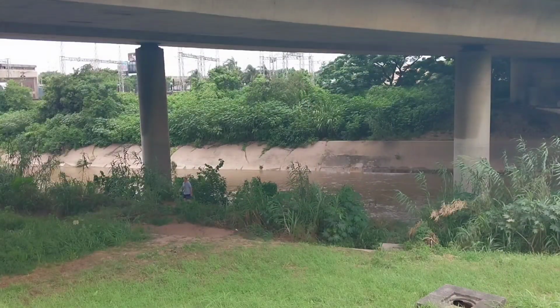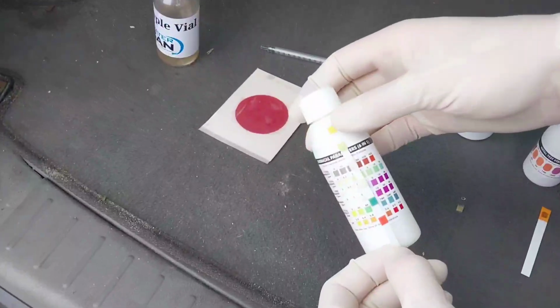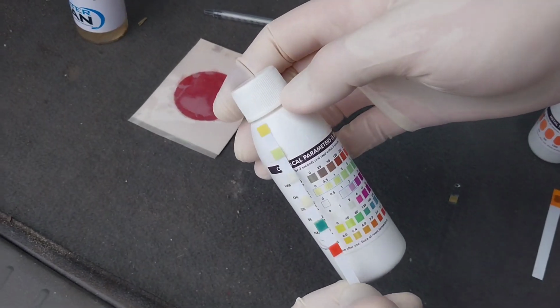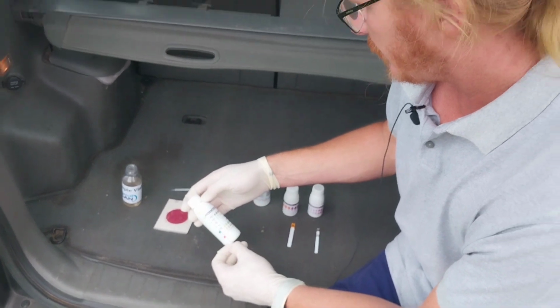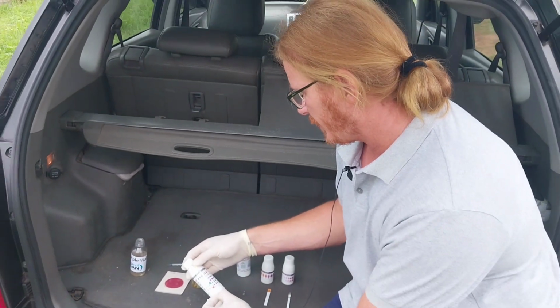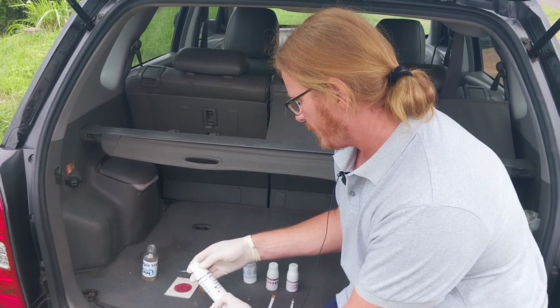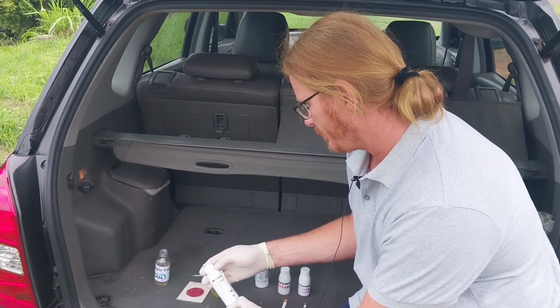Let's take a look at the chemical results quickly. We've got a high level of pH, as you can see, which is obviously not great. Once again, high levels of anything are not good, specifically for people immunocompromised. Then we've got total alkalinity is also very high. High alkalinity is not great, and that is something that's probably got to do with waste upstream.